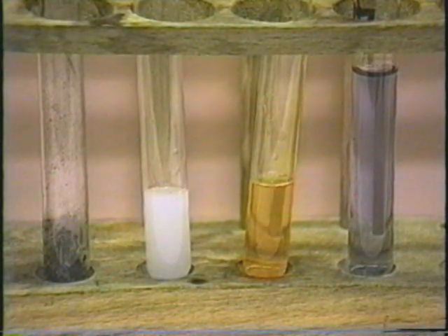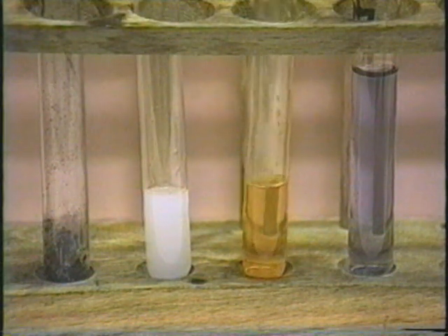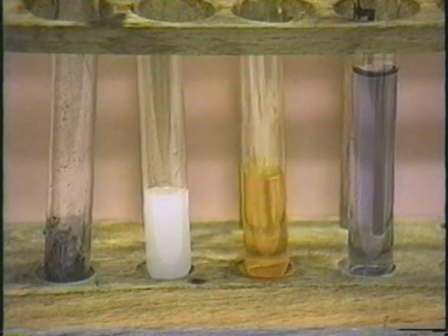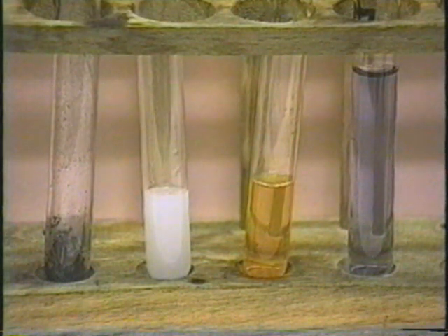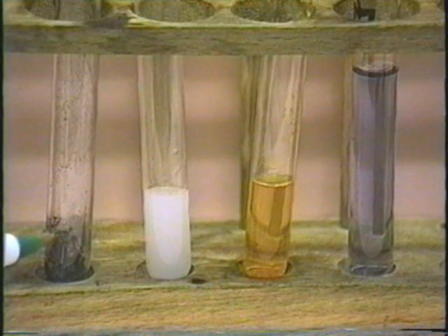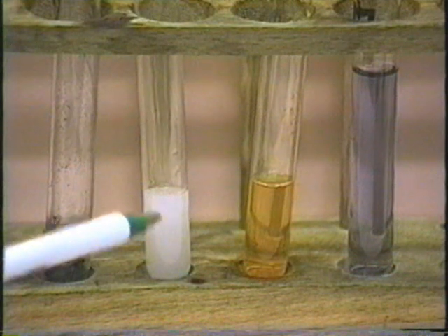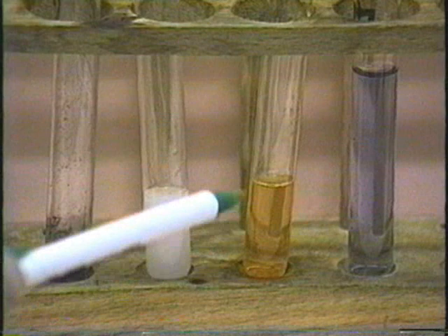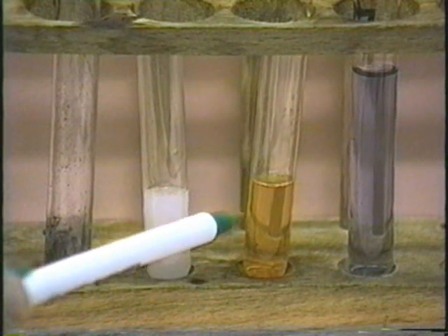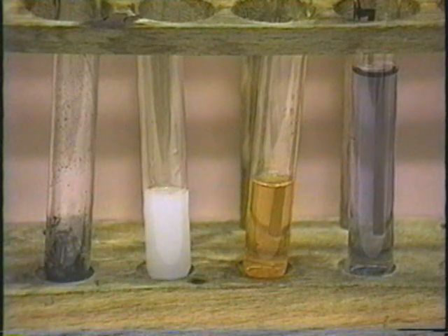and as you can see, no precipitate is forming here. We'll stir that up a little bit. There's no precipitate formed. So there are the results of our analysis. For mercury, we get a confirmatory black precipitate. For silver, we get a confirmatory milky white precipitate. And for lead, we get only a clear yellow-orange solution. Therefore, there is an absence of lead.